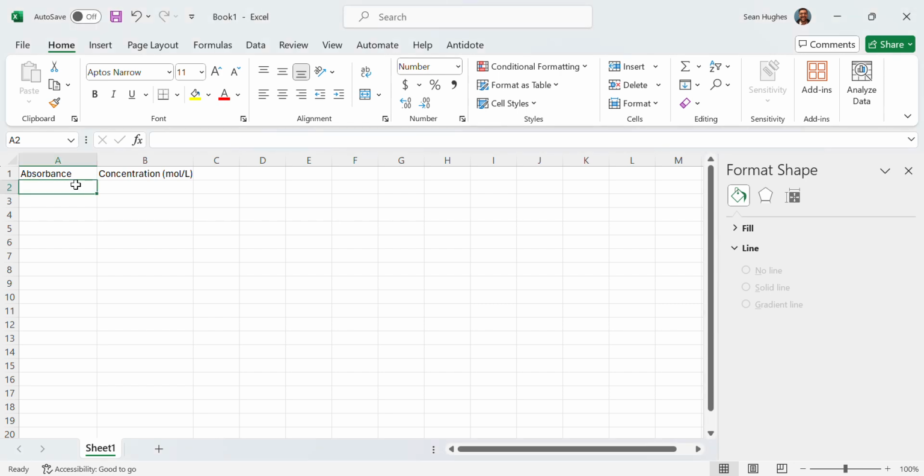So I'm just going to go into my data table now, and I'm going to type in all the data that I had recorded. This is my fake data, so don't put too much stock into what the values are. Now you'll notice that all of my data points are being punched in and you have 3 decimal places. You may find yourself that as you're punching in your data, it's sort of rounding off things inappropriately.